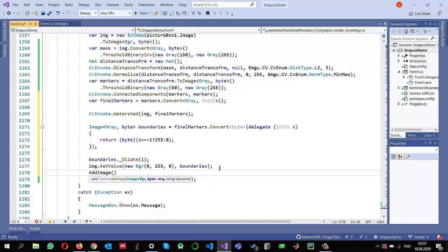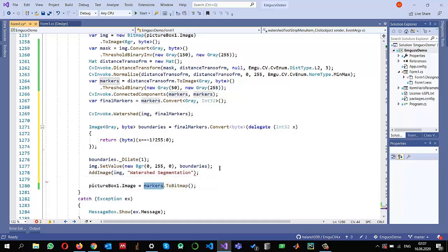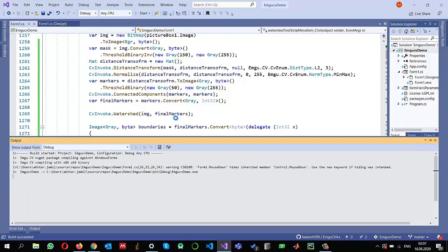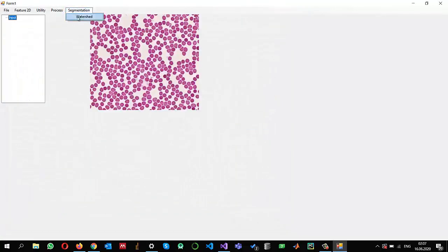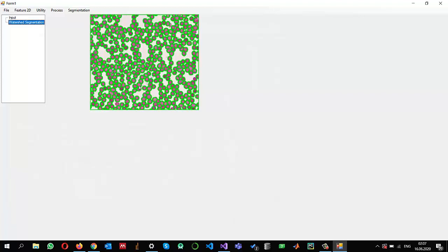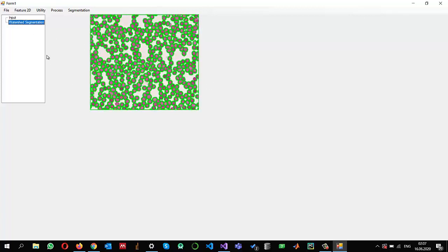Optionally I display the data in a custom tree view, passing `img` labeled 'watershed segmentation', and also show the image in my picture box. Running the application, I open the blood cell image and click watershed — you can see the segmentation results with green boundaries drawn around each blood cell. That's it for this video, and I hope to see you in another video.